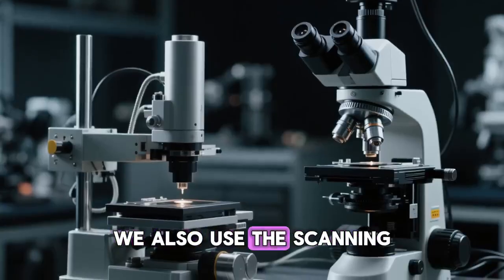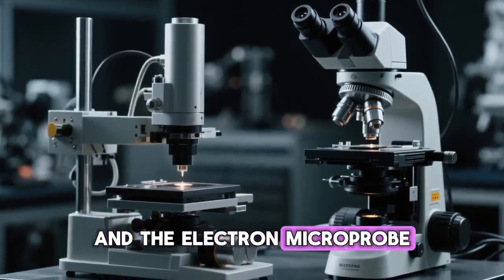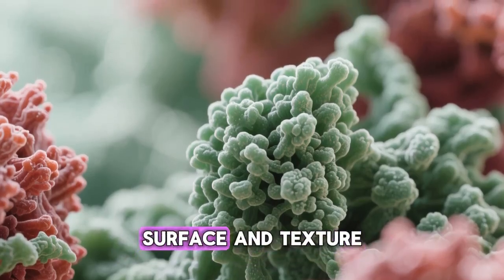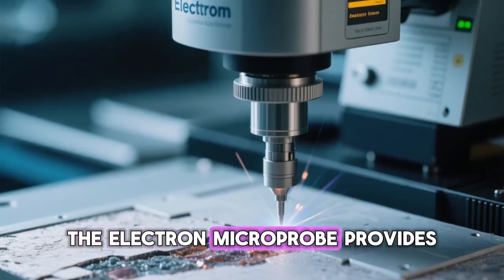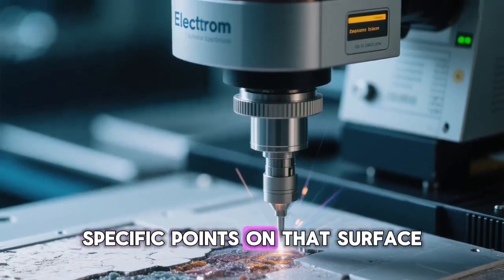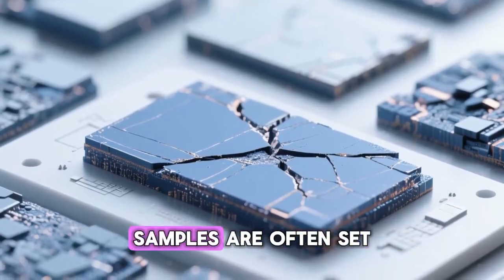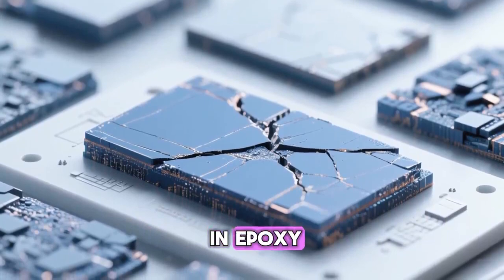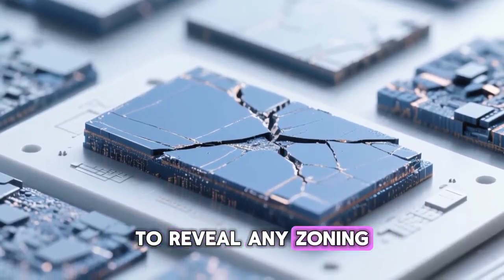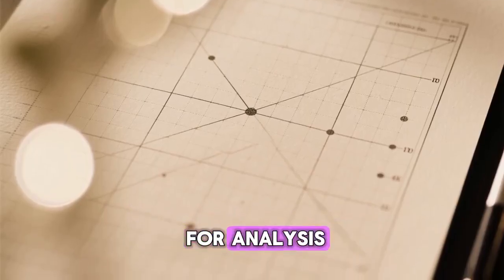We also use the scanning electron microscope, or SEM, and the electron microprobe. The SEM gives us high-resolution images of a sample's surface and texture. The electron microprobe provides compositional analysis of tiny, specific points on that surface. Before this type of microanalysis, samples are often set in epoxy, polished perfectly flat, and imaged with the SEM to reveal any zoning or cracks. This helps the analyst choose the best spots for analysis.